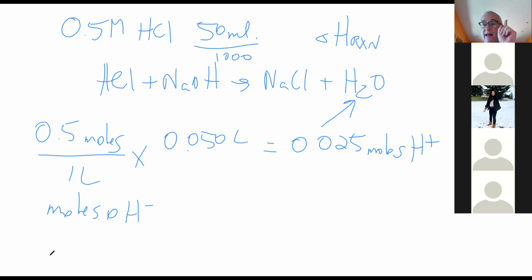I added the acid in a solution. How did I add the hydroxide? Solid. What was the solid? NaOH. What do we call this? Base. Sodium hydroxide, right. So my base is sodium hydroxide. I added solid sodium hydroxide.